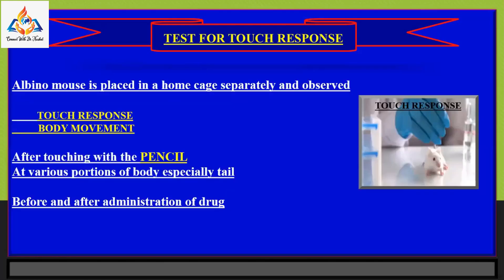In the touch response test, an albino mouse is placed in a home cage separately and the touch response and body movements are observed after touching the animal with a pencil at various positions of the body, especially the tail. This is done before and after administration of drug, and the touch response is noted and both results are compared.